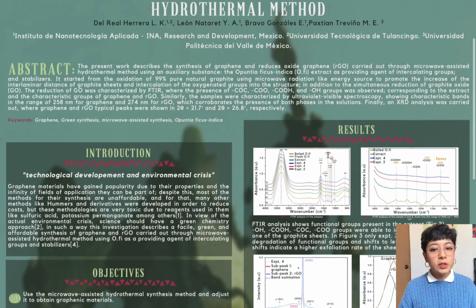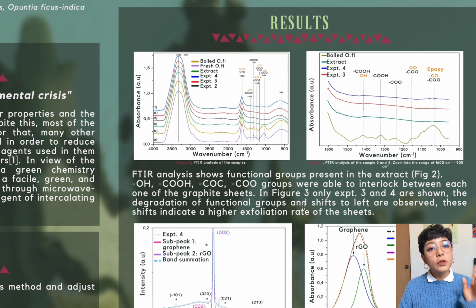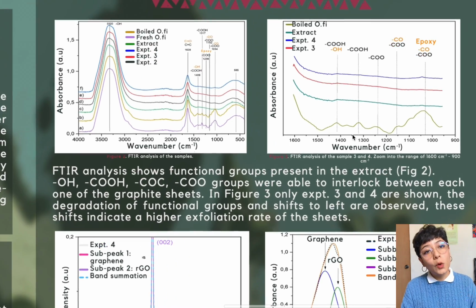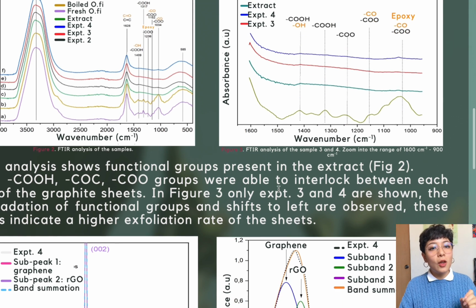Okay, now let's go with the results. The samples were analyzed by different techniques. First, FTIR analysis. In figure 2, the analysis showed the functional groups such as carboxyl, hydroxyl, ketones, epoxy, etc., present in all the solutions. Now, in figure 3, we make a little zoom on the fingerprint of the samples. We can see with the naked eye the high rate of degradation of the functional groups and shifts to the left, which means a higher exfoliation rate of the sheets.